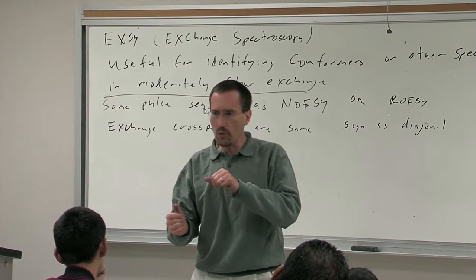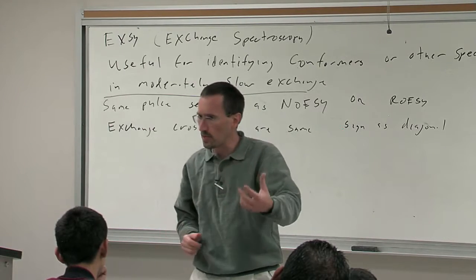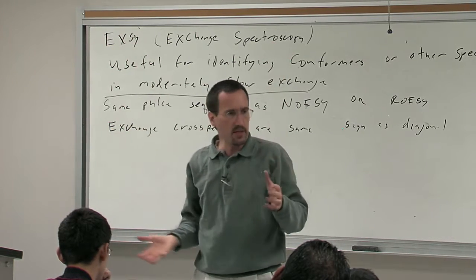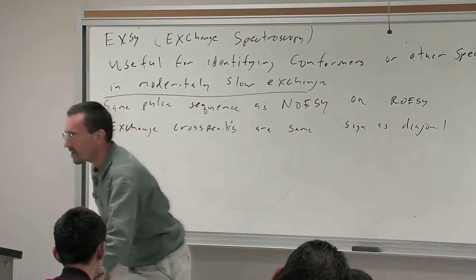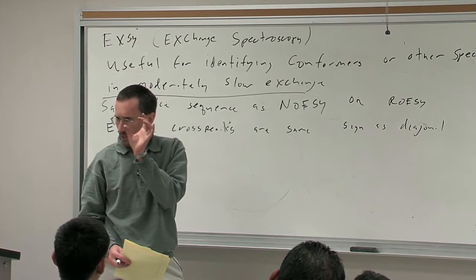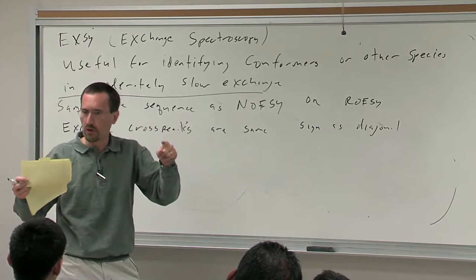In other words, if you have an amide that rotates very slowly, remember we talked about time scale and energy barriers and temperature, you have to raise the temperature to get up into that regime of having exchange. Now, a lifetime of 100 milliseconds means an extra 4 hertz peak width. In other words, the peak width at half height becomes 4 hertz wider.